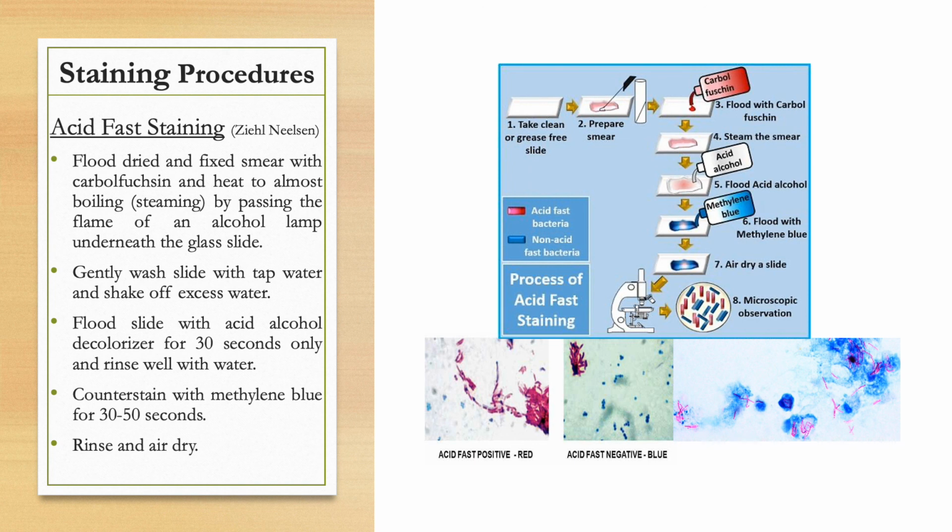All right. It's also important to note that when you are heating your slide using the Ziehl-Nielsen technique, do not let the stain dry out.